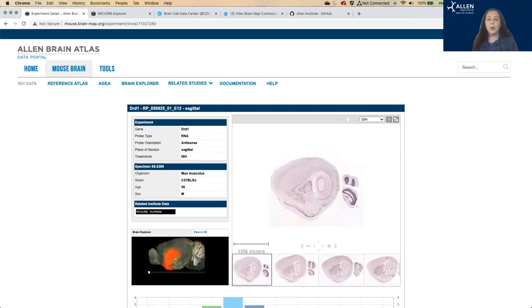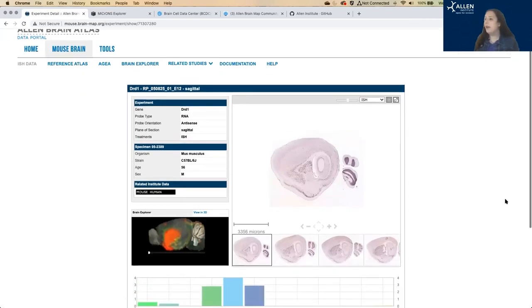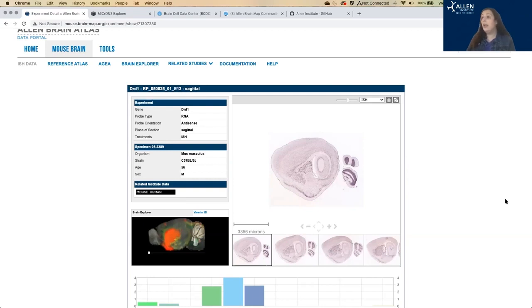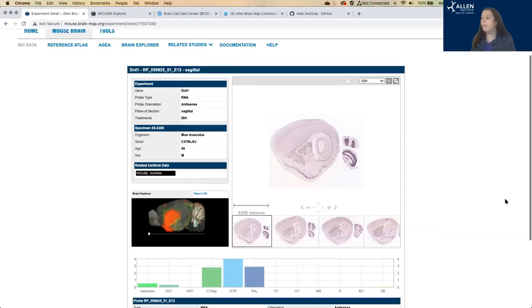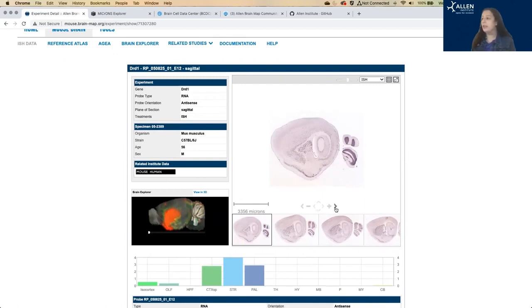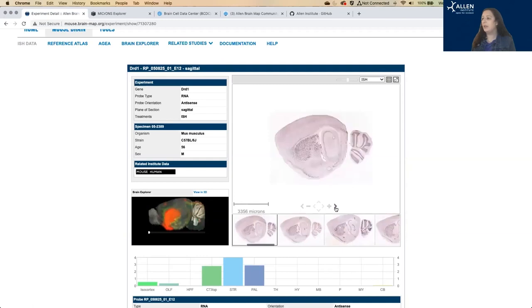So what you're looking at here is slices of ISH data. We have brain slices that are showing the expression level of, in this case, DRD1. And this is sagittal, so these slices are being arranged from the lateral edge of the brain towards the medial. And you can use these arrows to navigate through these slices.